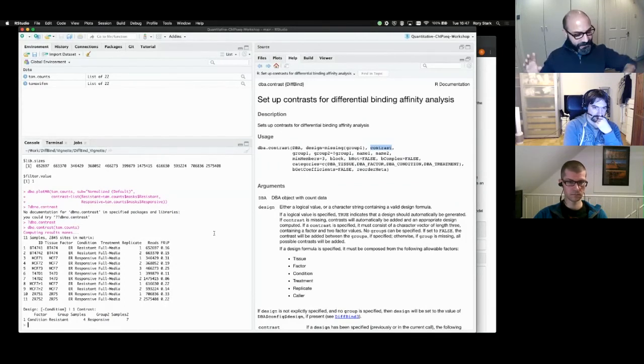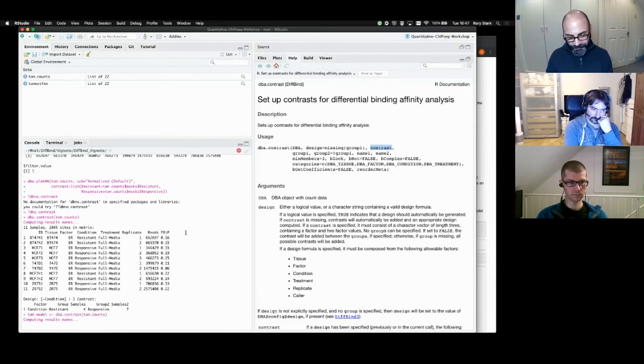Now I'm going to skip ahead because of time. I know from modeling this data, I remember we looked at the clustering, that we really need to take into account the fact that we have all this biological variation in our tissue types, particularly this issue with MCF7, but even all the other tissue types. And it would be nice to be able to model that as well. So what I can do here is, let's say I'm going to do the default one. I'm going to call this tam.model. And repeat that.